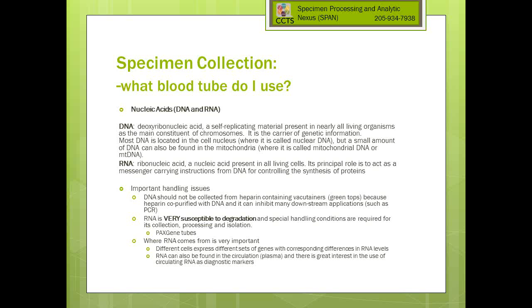For a number of studies, we actually have multi-site collaborations where people are sending us patient samples. They have Friday clinics, so they send on Friday, we get it on Monday. They just ship it room temperature. We can get the blood on Monday, work it up, and the DNA is usually fine for most applications that we do. The longer it sits, the more likely it's going to be degraded, but typically DNA is much more stable.